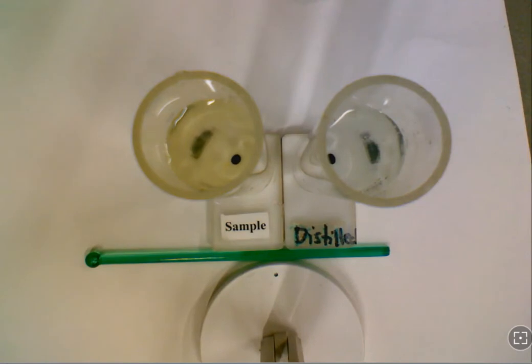All right, so now you want to examine the dots that are at the bottom of each container. I'm going to highlight those right here, and there's one right here. We know the distilled water is clear, and we want to compare the clarity to the sample water on the left, noting what the water looks like, not necessarily what the color is.